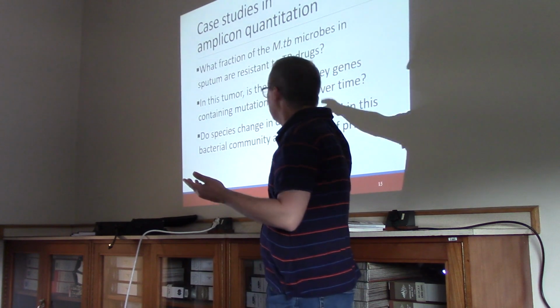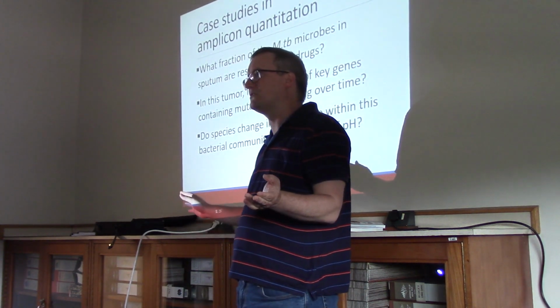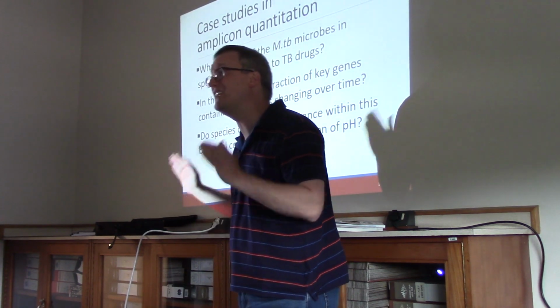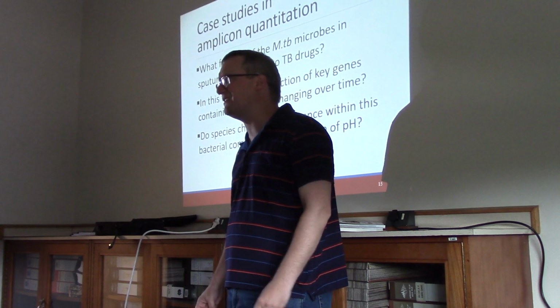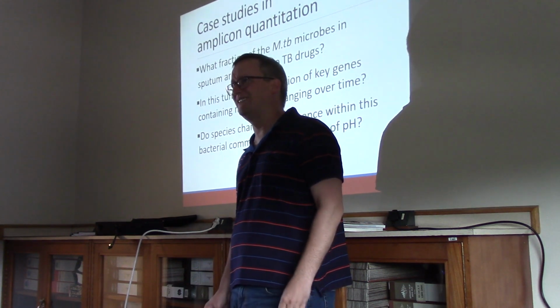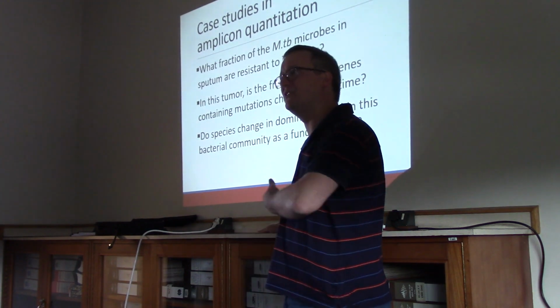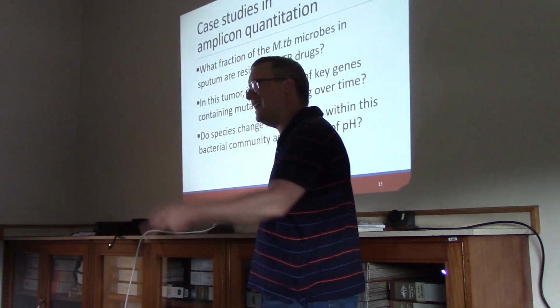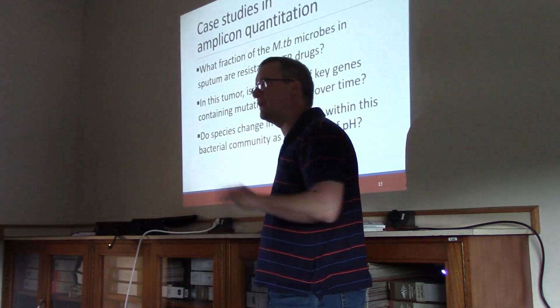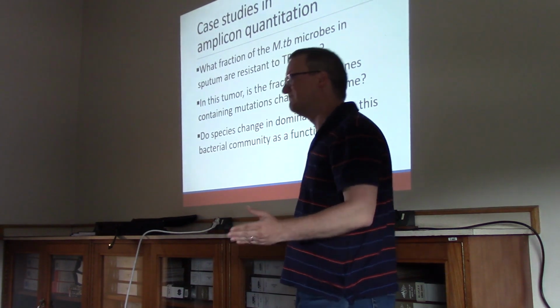It's one that has lots of mutations that have absolutely nothing to do with this disease getting worse. And grandpa's going to live another 20 years, and maybe that tumor will have grown another 10%, but it's not what's going to carry him away. So, being able to monitor the development of mutations within a subset of genes, again, looks a lot like these microbiome analyses, except in this case, we've annotated all the genes.